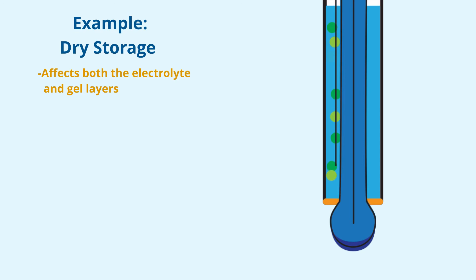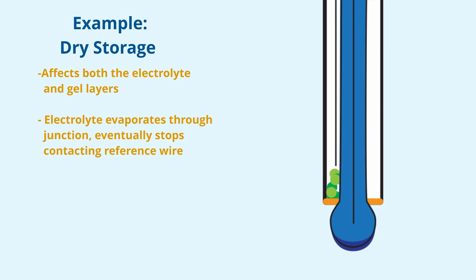As you can see, the reference electrolyte slowly evaporates through the junction. Eventually, the electrolyte no longer contacts the reference wire and the electrode stops functioning.